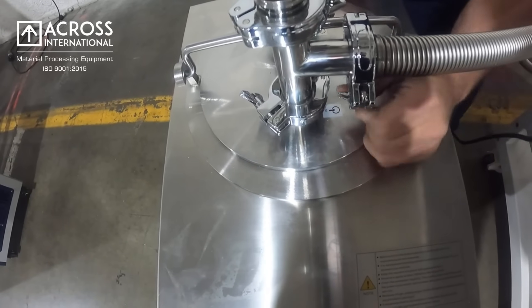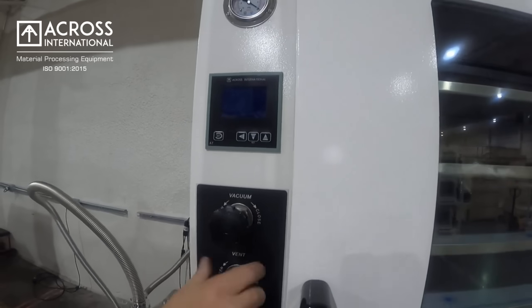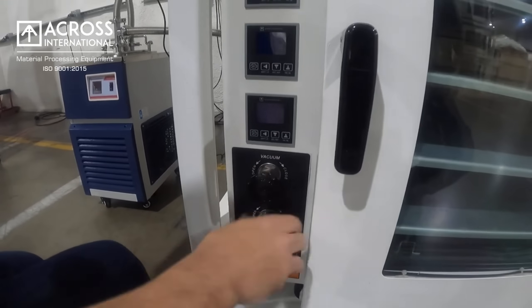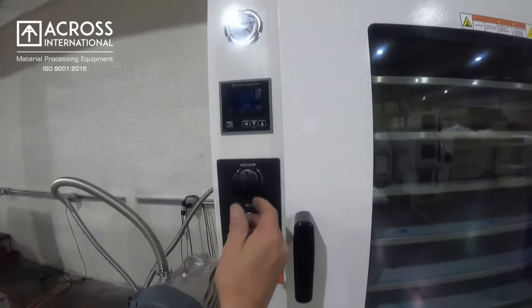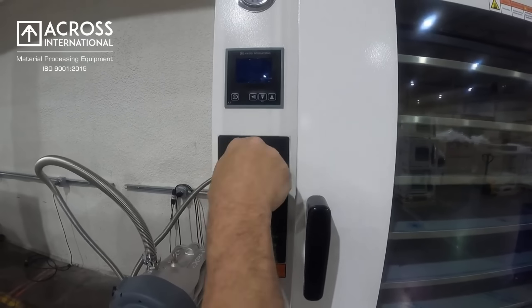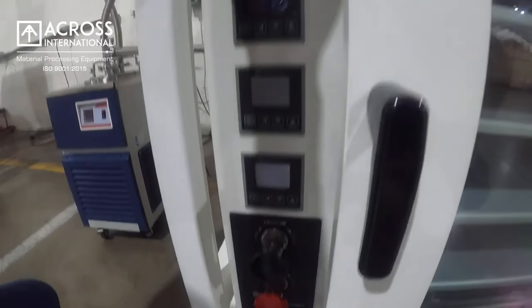At this point we're ready to pull vacuum. Close your valves. Start your pump. Open your vacuum valves. You'll notice we're starting to pull vacuum. Lower oven, open the valve. Pulling vacuum.